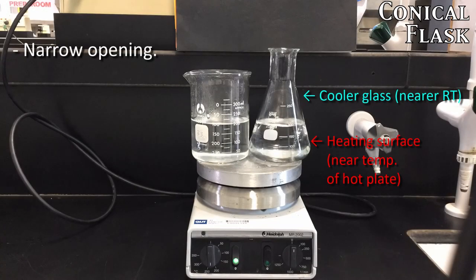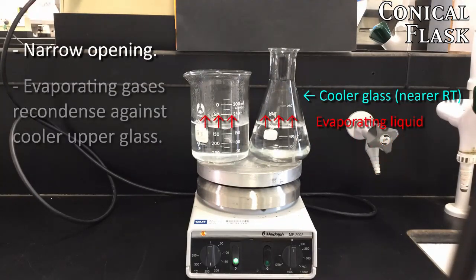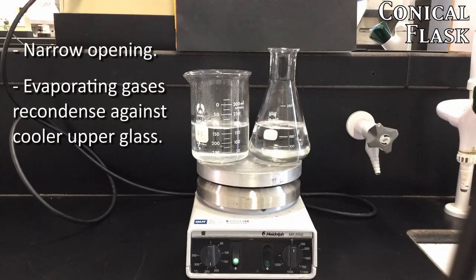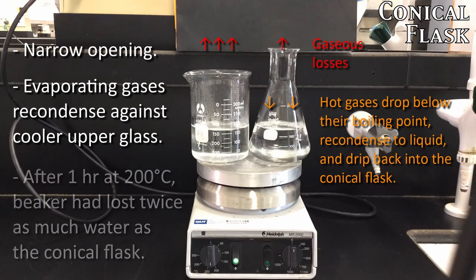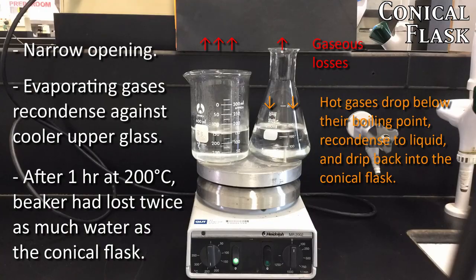The difference in design is most significant when working with boiling liquids. In this demonstration, the conical flask is able to retain more of the boiling liquid because the narrow neck allows evaporated gases to hit the cooler upper walls of the flask, where they recondense and drip back in a liquid state.